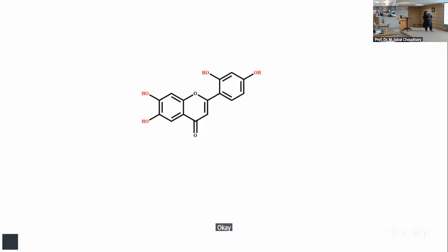We have quaternaries, and how many methine CH are there? 6, right? Any CH2 here? No.